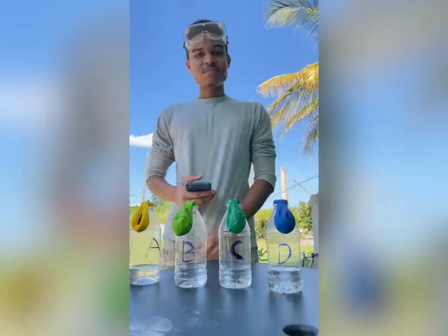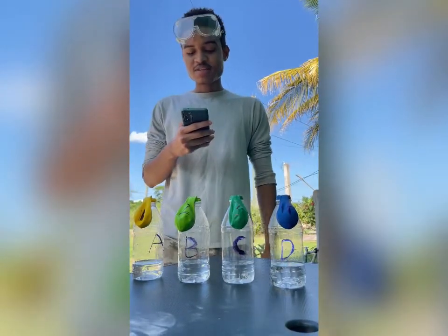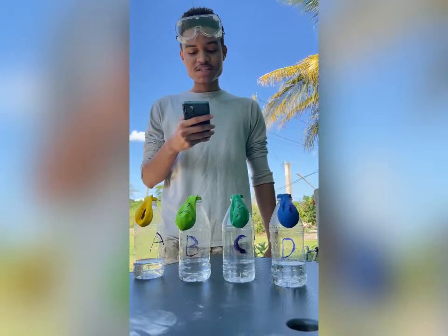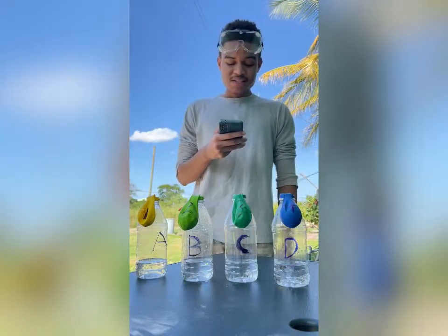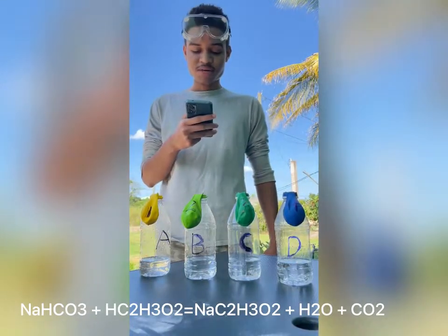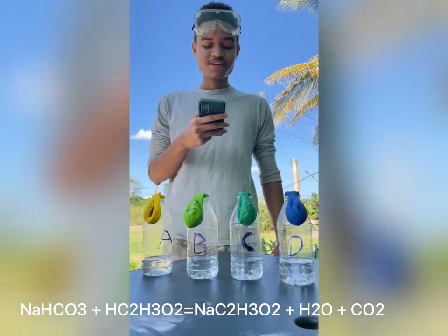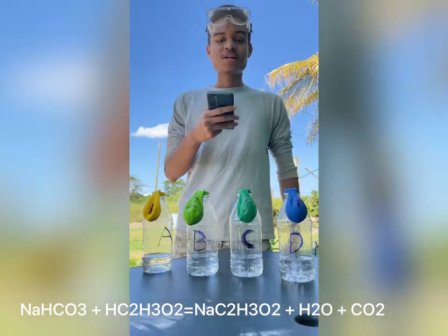Hello everyone, my name is Omridistan. The objective of this experiment is to determine what the limiting reagent is when baking soda reacts with vinegar. The balanced equation for this reaction is when sodium bicarbonate reacts with the organic compound of acetic acid to form sodium acetate, water, and carbon dioxide.